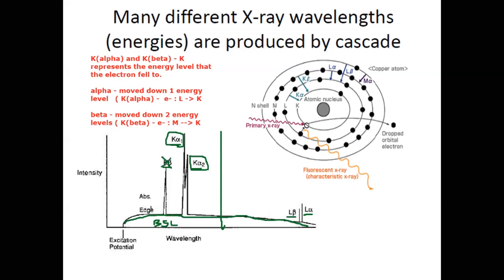Now for copper source radiation, the K beta is very close to the K alpha. So what you would have to do is filter out or account for the K beta radiation so that you can remove the intensity due to K beta out of your data. Because we're only interested in K alpha as the characteristic X-ray that we want. We don't want K beta, and with most X-ray diffractometers we have beta filters which filter out the K beta, so we don't need it.